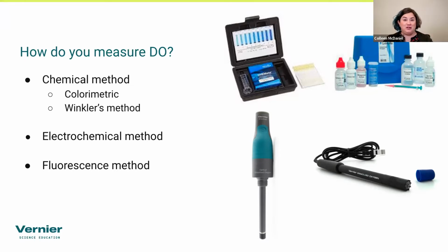And for best results, you have to make sure to calibrate it based on your temperature and pressure to where you're located. One of the things about this is that it can be very accurate and give you really good readings. The problem though is that the warm-up time and the calibration process is not a simple process.